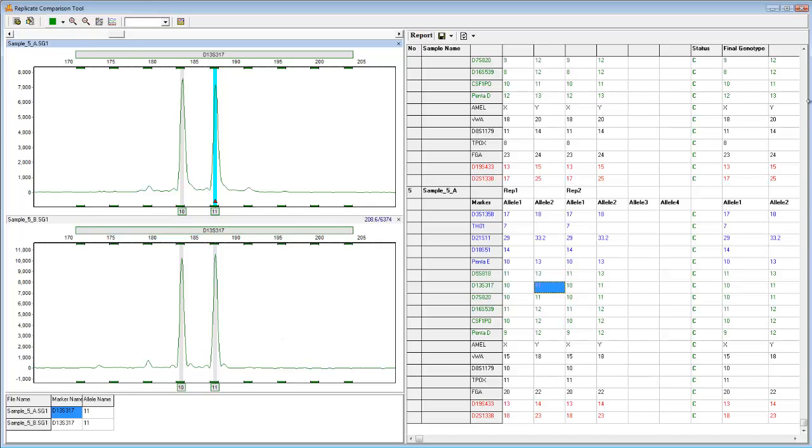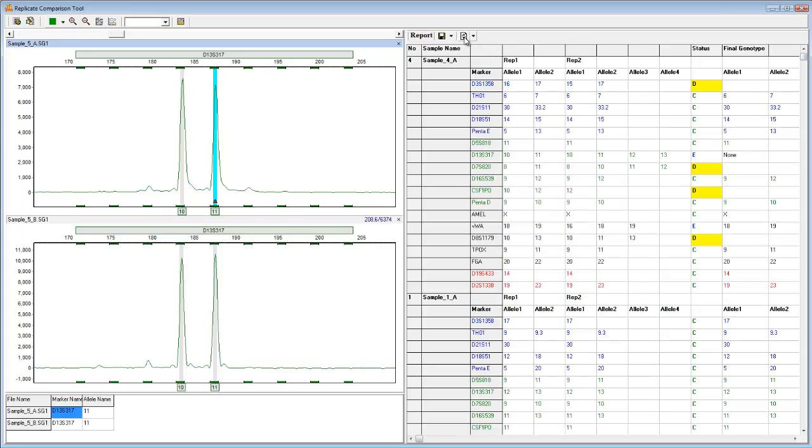10 and 11. And as I mentioned, that's because there's a shuffle feature here where you can sort the table by status or by group sequence. In this case, sort by status is the default, and that just pushes replicate groups with discordant calls to the top of the table so that they're easier to find. And that's actually really helpful if you're analyzing groups of 30 or more replicates. The ones with discordant calls get pushed to the top. You can bring your attention to them as quickly as possible.